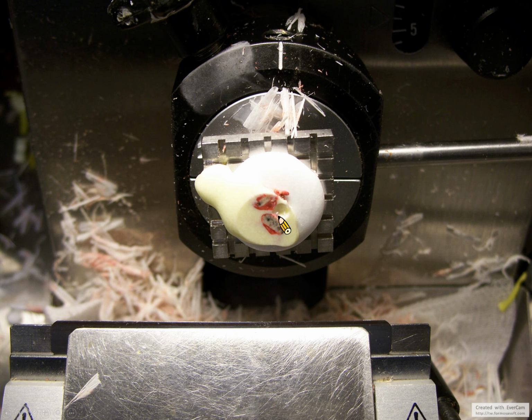So the pathologist was called into the hospital. Then the pathologist needs to process these tissues, and because the patient is still on the surgical table, we need to do things very quickly because the patient is still under anesthesia and cannot wait for a long time.